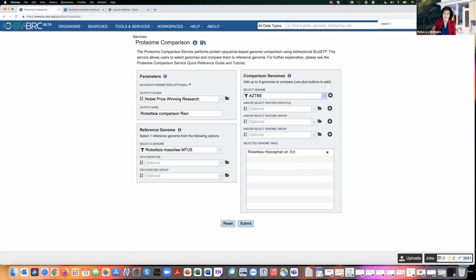I'm just trying to show you how you can take different things here. Now look at this. There are two of them here. Which one do I use? I think I'll use this one. This indicates to me it's a second initial sequence by, I believe, Rocky Mountain Biological Lab, but I'll just choose this one. And then I had my private genome that I wanted to look at, and in this case I could even add the genome ID number for the genome that I liked the best.